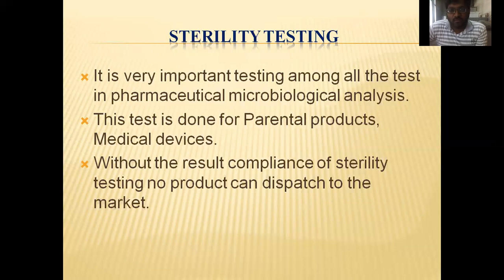This is why sterility testing is important, because without a compliant sterility testing result, no product can be dispatched to the market. You have to submit the sterility testing document for compliance, and only then will that product be dispatched into the market.